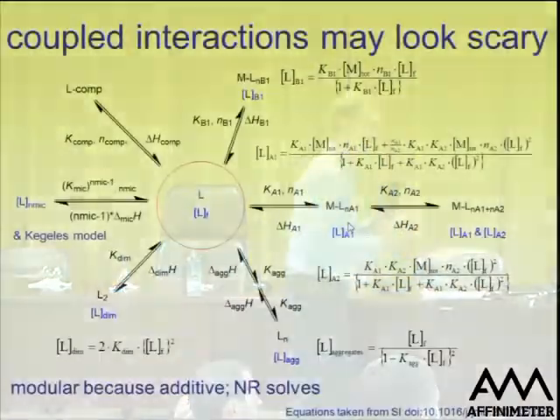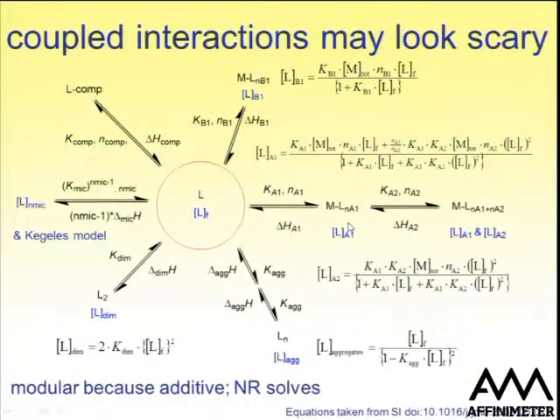This binding model is actually a consecutive binding model because we've defined it as if the ligand binds in the first binding site A1, that binding event creates a second binding site, and then you have binding in a separate binding site A2. So this is a consecutive binding event because binding site A2 simply does not exist if A1 hasn't bound first.